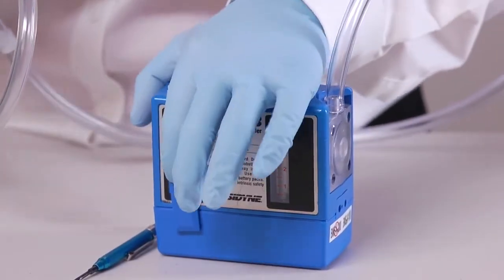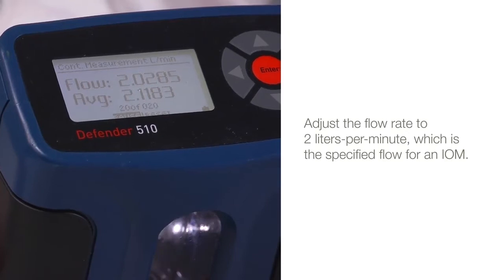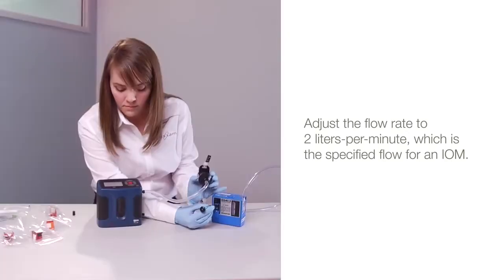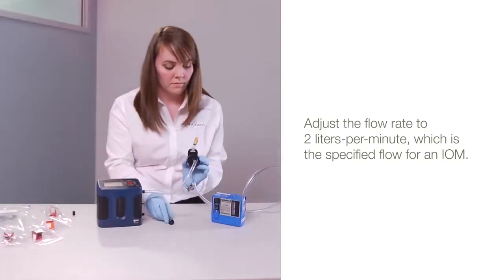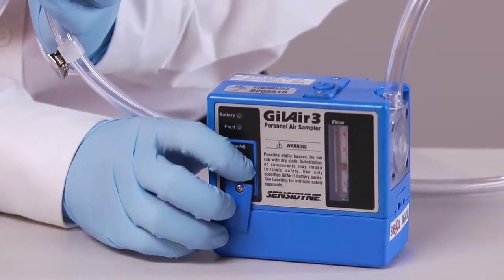Turn on the pump and adjust the flow rate to two liters per minute, which is the specified flow for IOM sampling. When finished, turn off the pump.